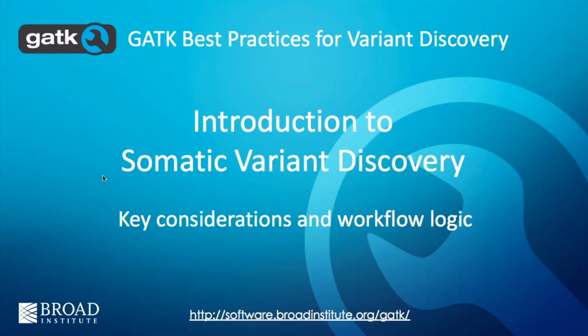After this, we'll talk about actually how do we assemble all of these things into pipelines, how do we run pipelines at scale, and all of that good stuff. But for now, let's talk about somatic variant discovery.